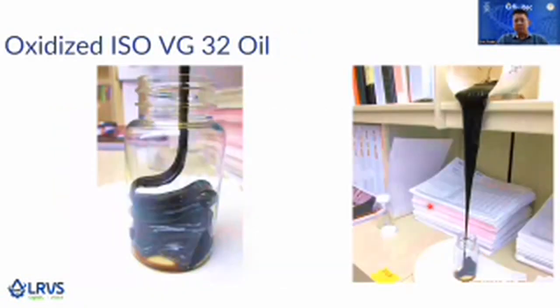The picture says 1,000 words. So this looks like sticky honey oil. This is the ultimate situation when the oil is oxidized and viscosity and other parameters are already out of spec. Of course, we do not want to see our operating oil look like this picture.